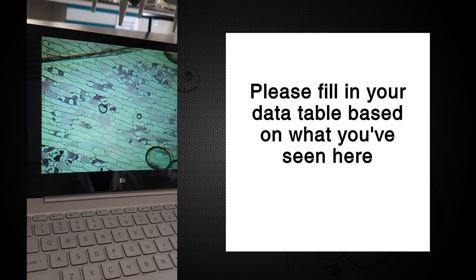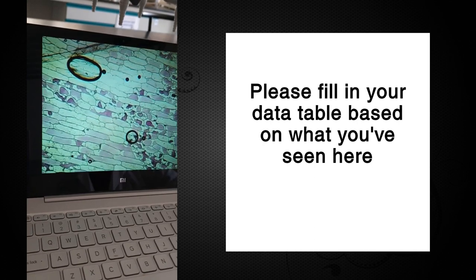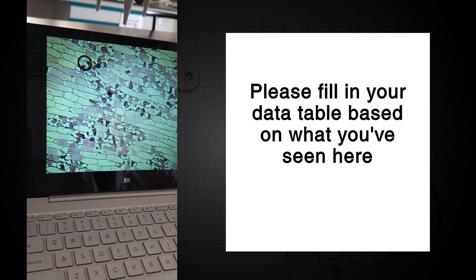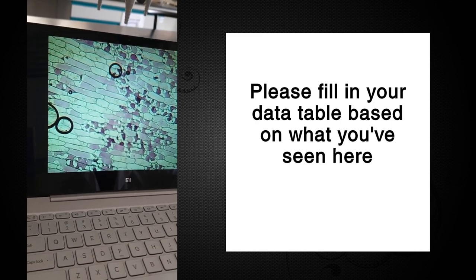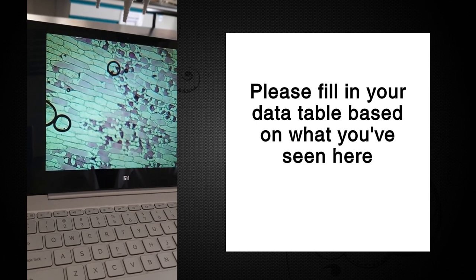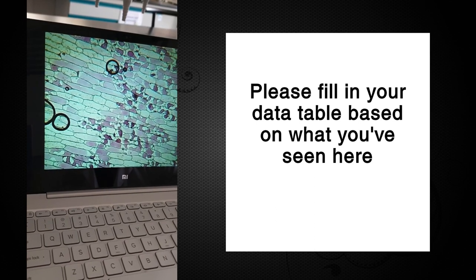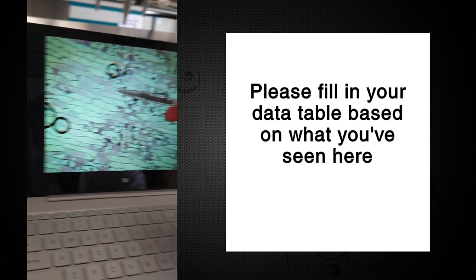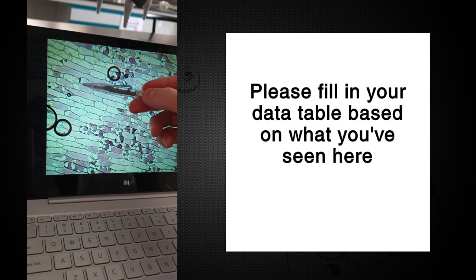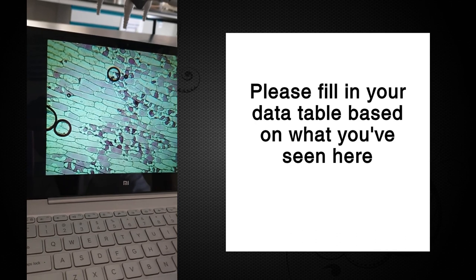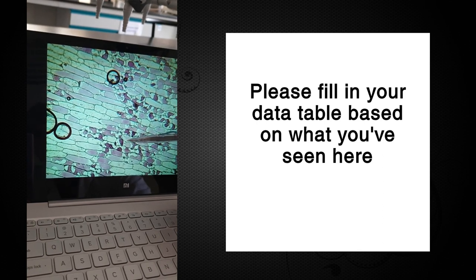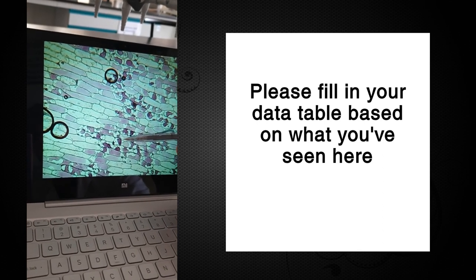Now, not all these empty cells are a problem. They were already empty to begin with, or at least they look empty just simply because these cells don't have a lot of pigmentation in them. But here we have a region that has a lot of these cells that have this pink cytoplasm. And so what you're seeing here is that they don't look the same. So some of these still kind of look normal, but you can kind of see them pulling away from the cell wall.